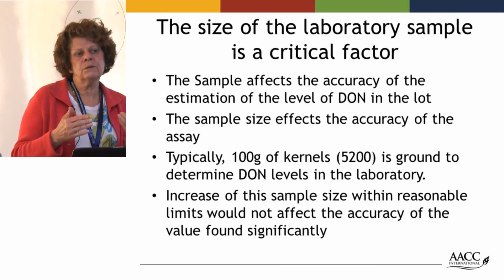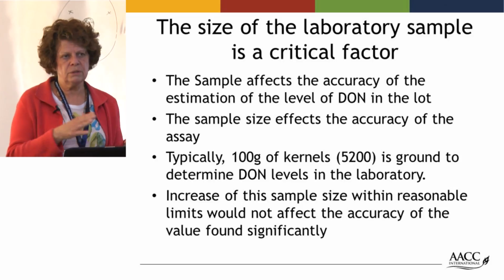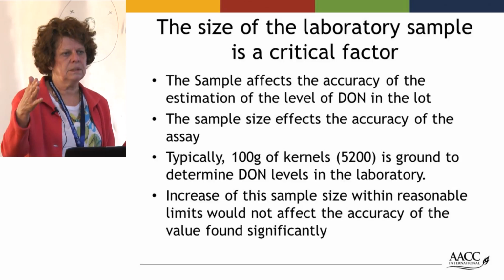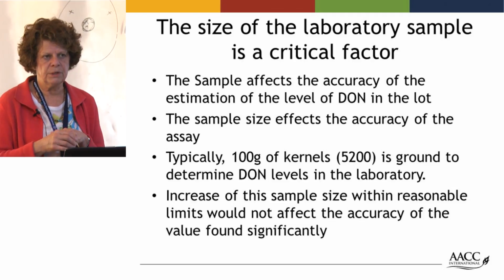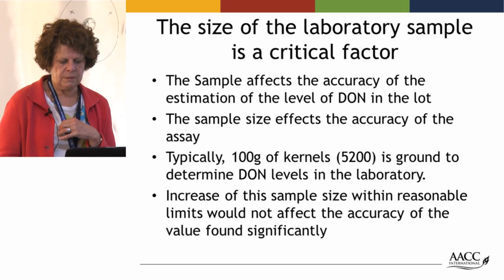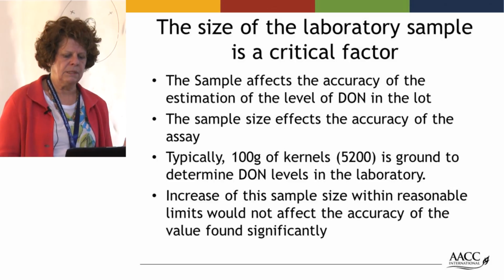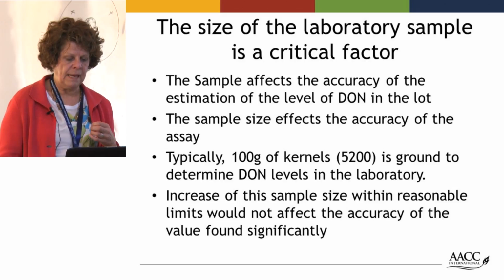And you can only increase your sample size. I went from 100 to 800. You can only increase it to a reasonable amount. You don't want bags and bags of sample coming into the laboratory. You don't want to have to grind and test all of those samples. So there's only a certain limit that you can increase the sample size to impact it.